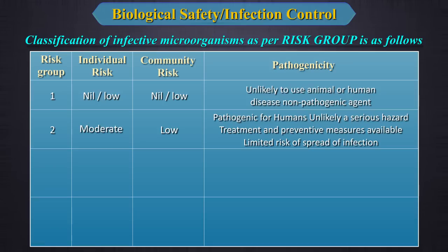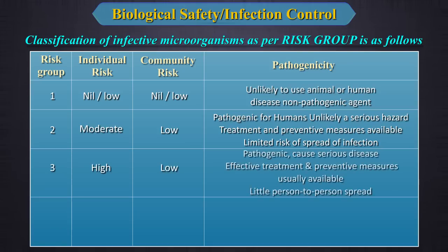Risk Group 3 means the individual risk is high and the community risk is low. It is pathogenic and can cause serious disease, but effective treatment and preventive measures are available and there is little chance of person-to-person spread.